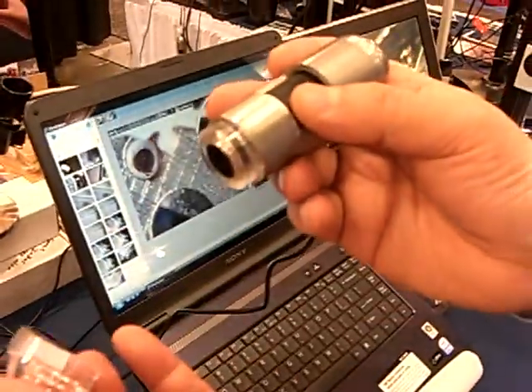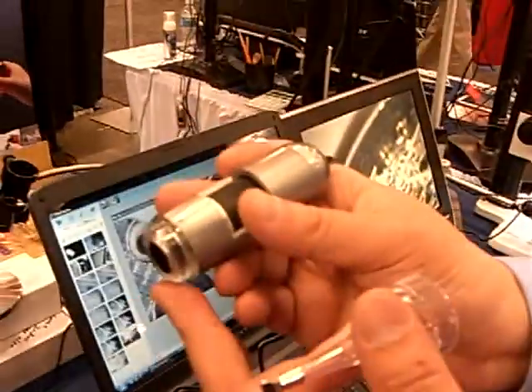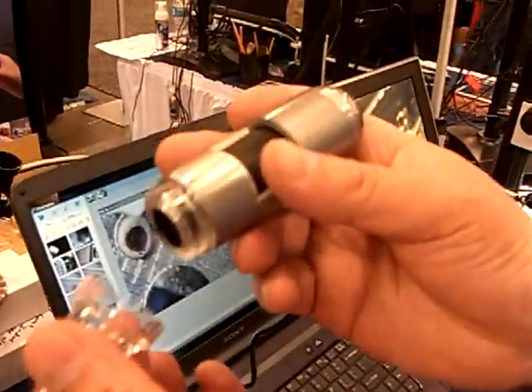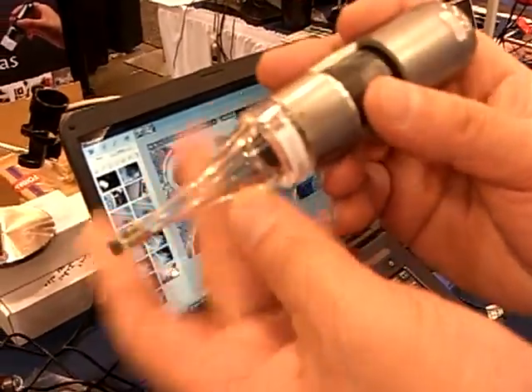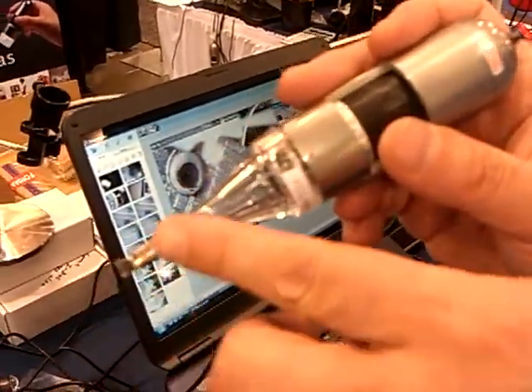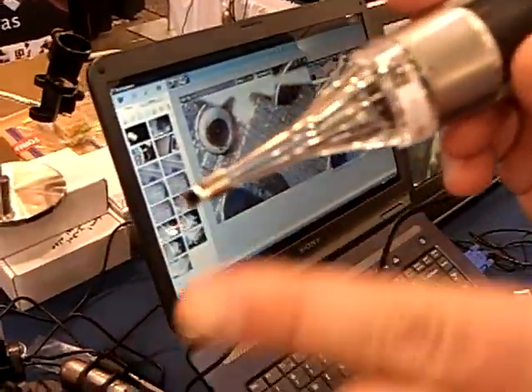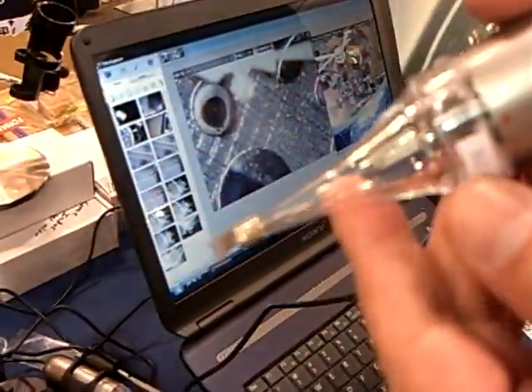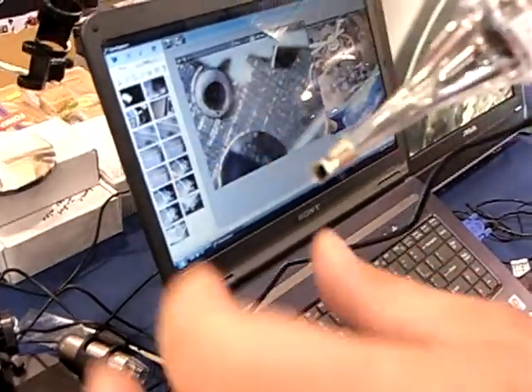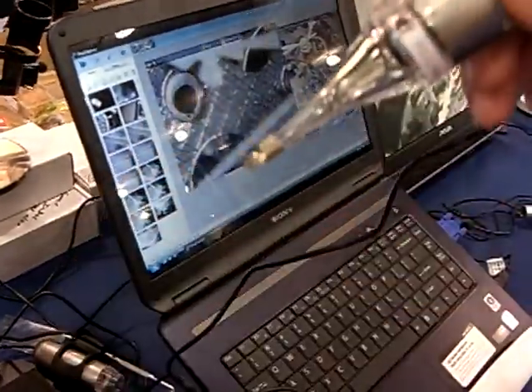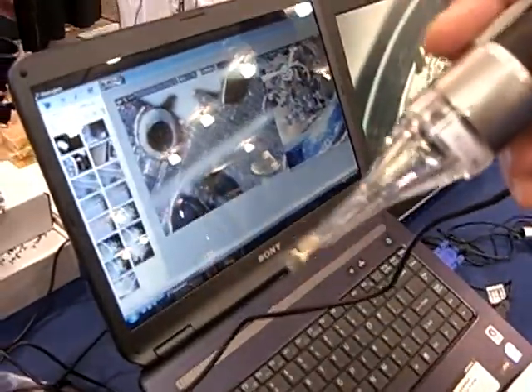You can take the cap out of the regular microscope and put a 90-degree adapter in. The mirror shows you the 90-degree work, allowing you to go like a borescope to see inside of a hole.